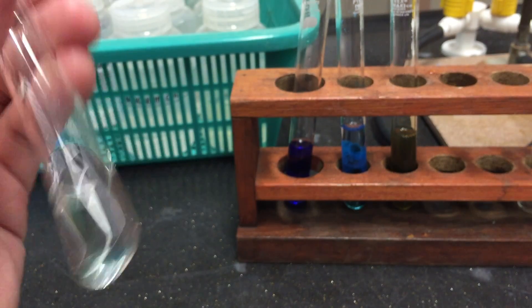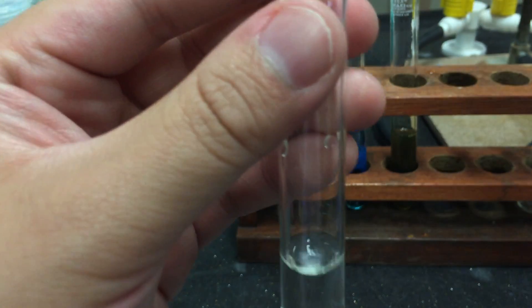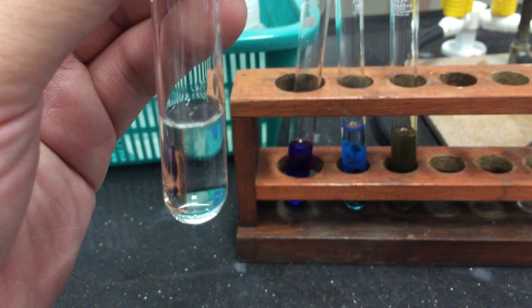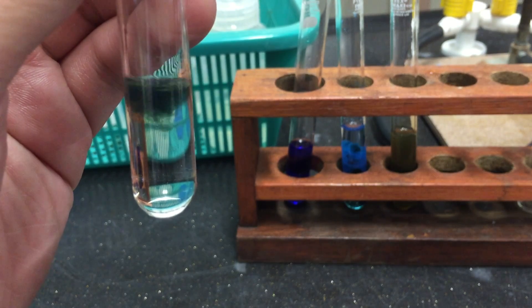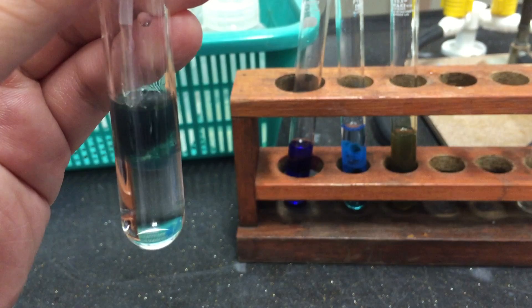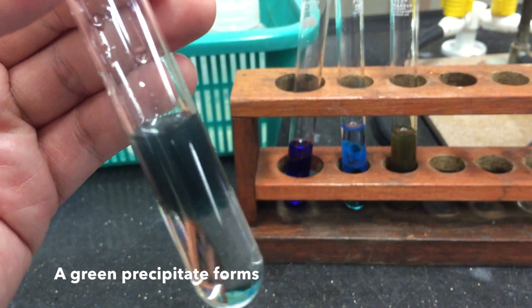You may also use ammonia to test for the presence of iron ions. To a small sample of your solution, add a few drops of ammonia solution. Notice that a green precipitate forms.